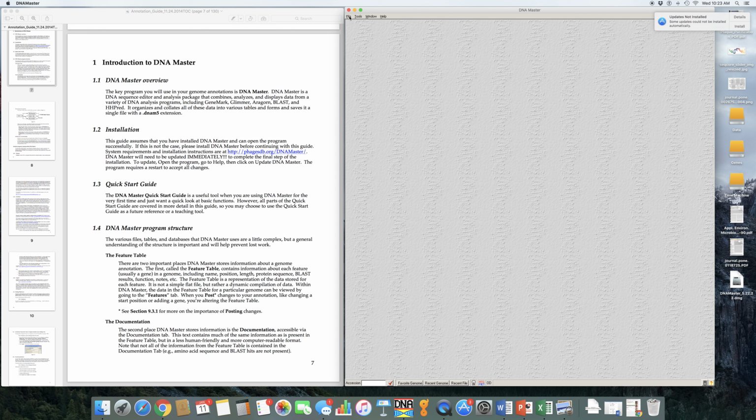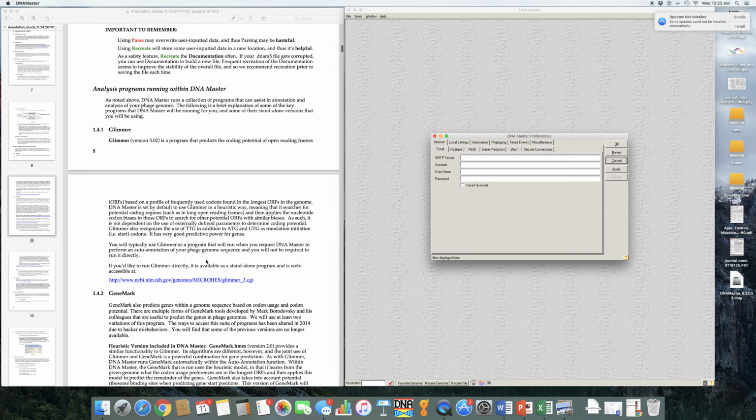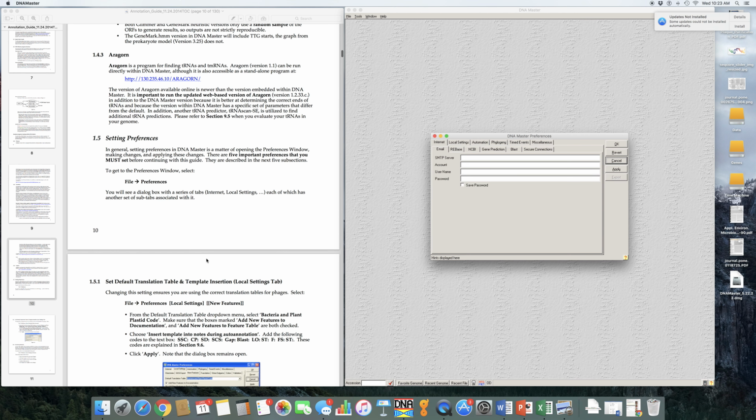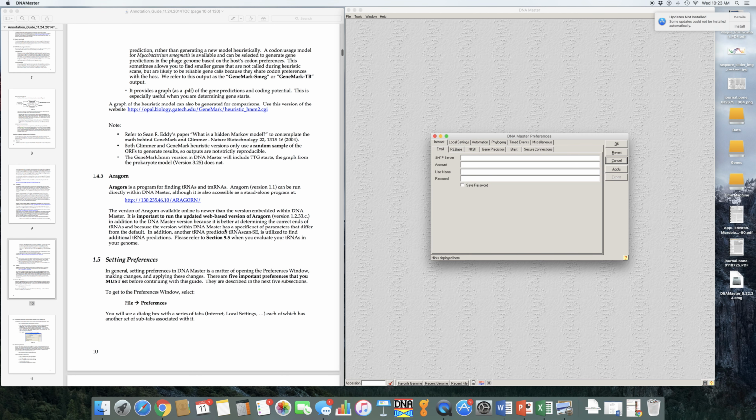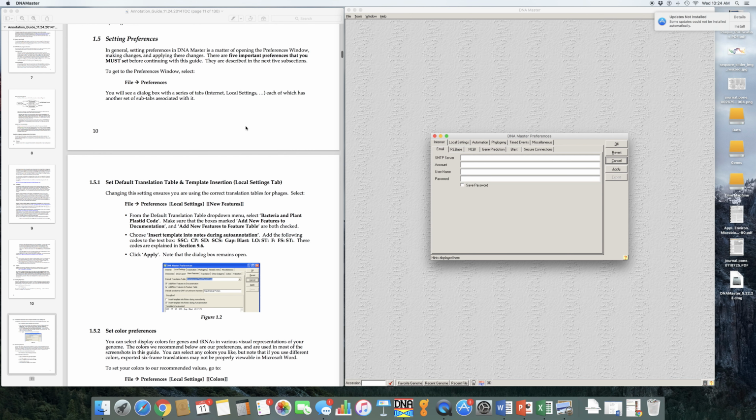So the next thing I'd like you to do is go to File in your menu and scroll down to Preferences. Click on Preferences. Meanwhile, over here, by reading from page 7 through about page 10, you will see the information that I presented to you in the first part of this video. I'm going to scroll down to Setting Preferences, and you can pretty much read through this section on your own and carry out the set up of the DNA preferences on your own. But I'm also going to provide you with a quick demonstration in case you need the visuals.